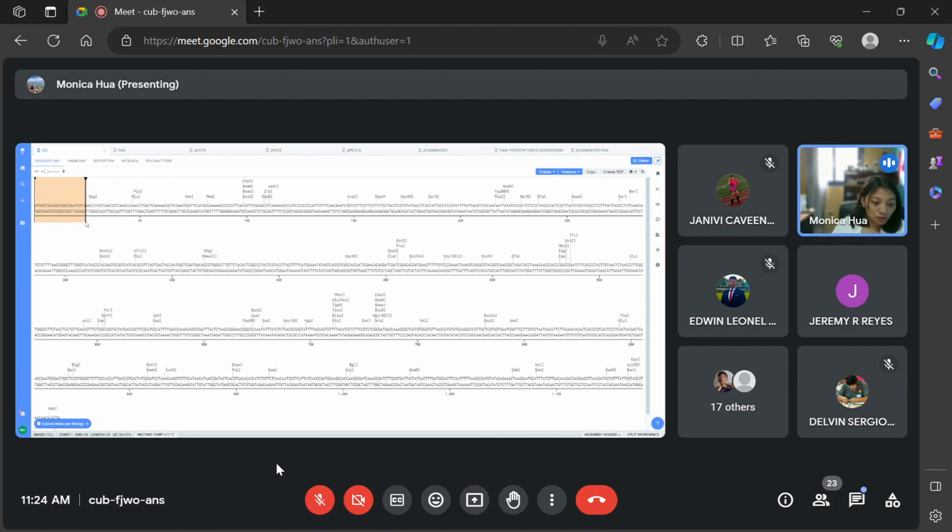Are you sure? Excuse me, what does the GC do again? The GC content is the percentage of guanine and cytosine on the template. So the ATGC, how many G's and C's you have, right? And we talked about in class that G and C bond to each other with a triple bond. So what that does is it's harder to break those bonds.